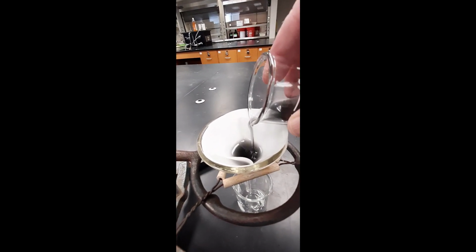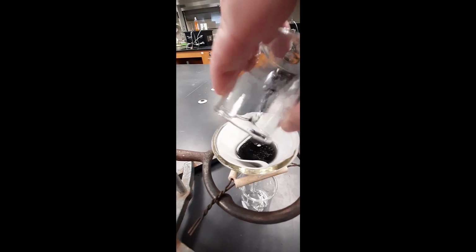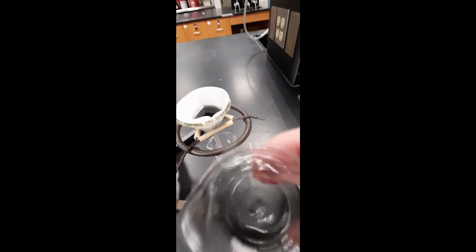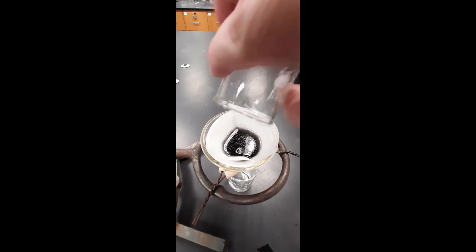I then add the mixture into the funnel. I spray down the material left over in the beaker with some deionized water, swirl, and add that to the funnel as well.